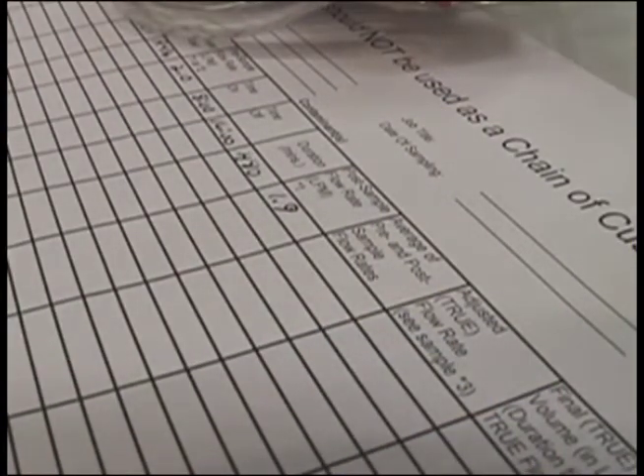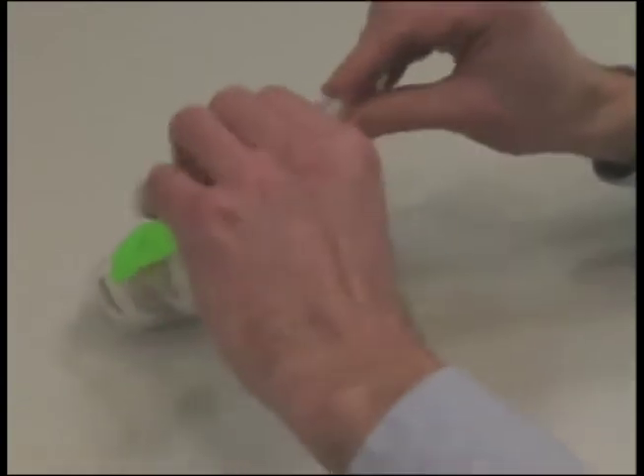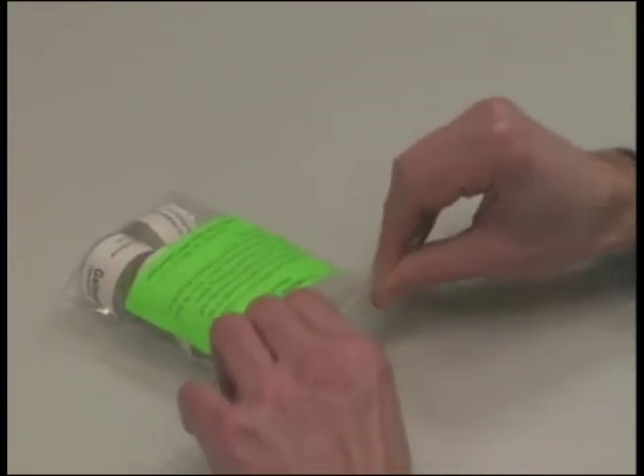Then record the flow rate on the pump calibration sheet. Reinstall the nibs on each end of the cassettes and place the cassettes in the Ziploc bag for shipment to Galson Laboratories.